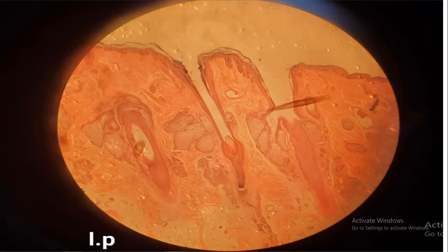In this practical, for this slide, you are required to locate and see the sebaceous glands. This is the area of interest.